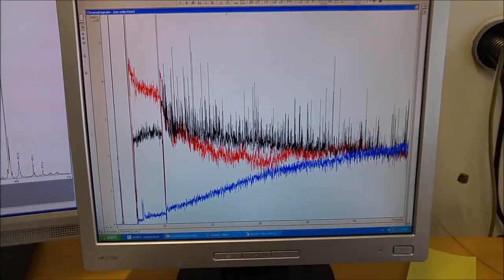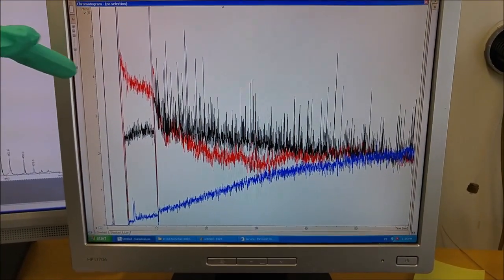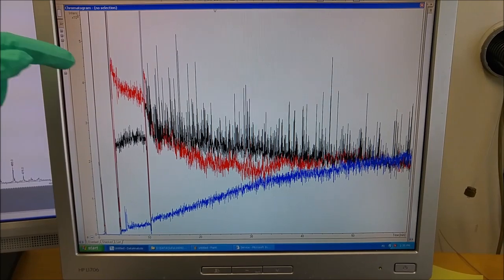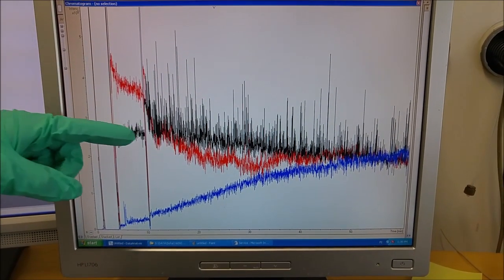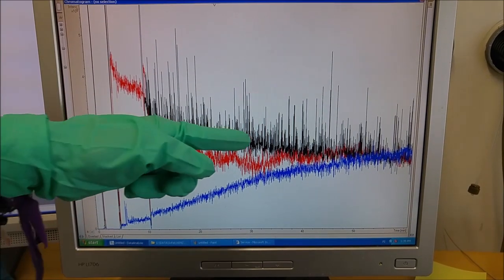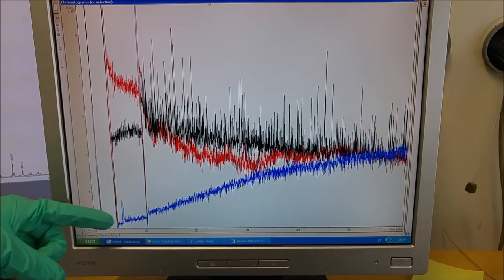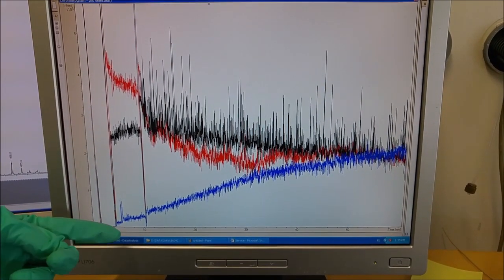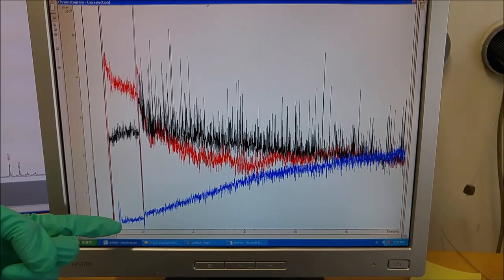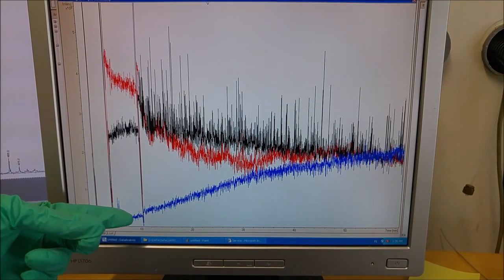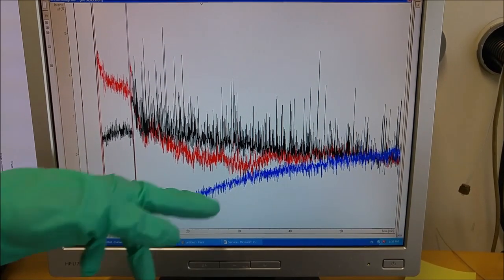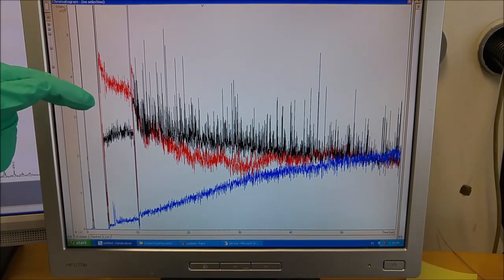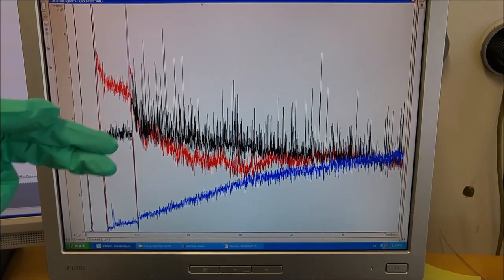And then we obtain an extracted ion profile of the two starting materials. Here the tetrazine shown in red and the trans-cyclooctene shown in black. And over time we can see an increase of the extracted ion profile of the Diels-Alder cycloadduct product, which is shown here in blue. So we can see that that one increases over time while the starting materials decrease over time.